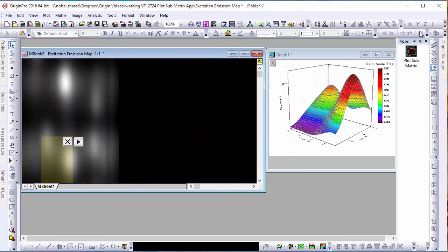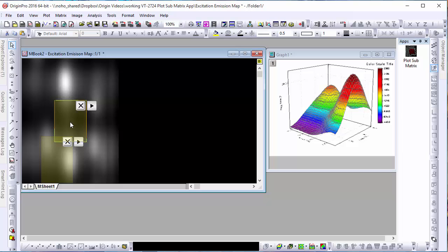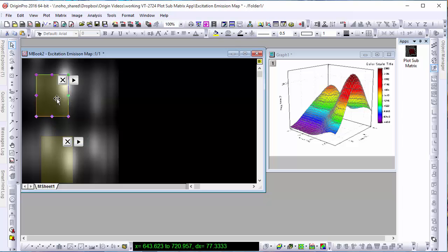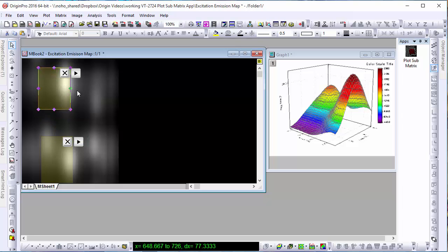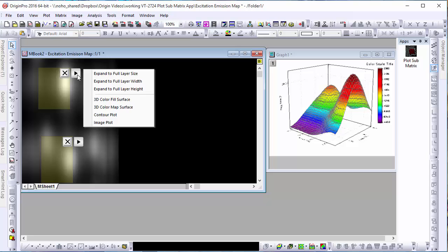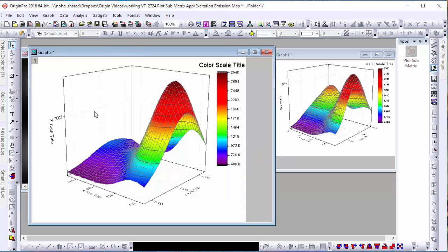If we click the tool a second time, we can generate a second region of interest, allowing us to plot and compare multiple sections of our matrix in real time.